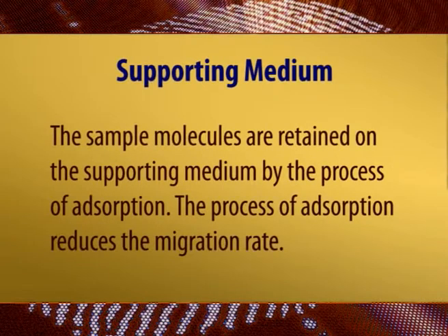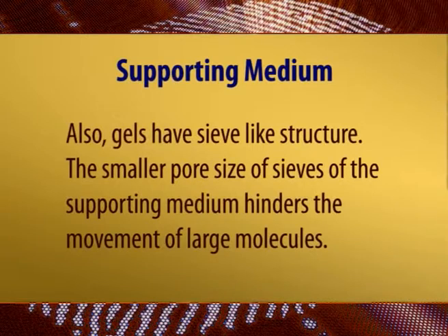Supporting medium. The sample molecules are retained on the supporting medium by the process of adsorption. The process of adsorption reduces the migration rate. Also, gels have sieve-like structures. The small pore size of the sieves of the supporting medium hinders the movement of large molecules.